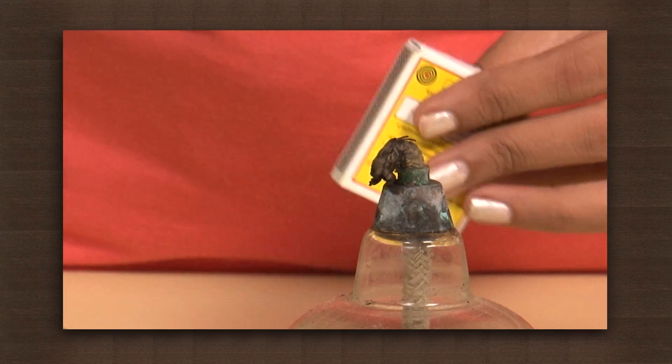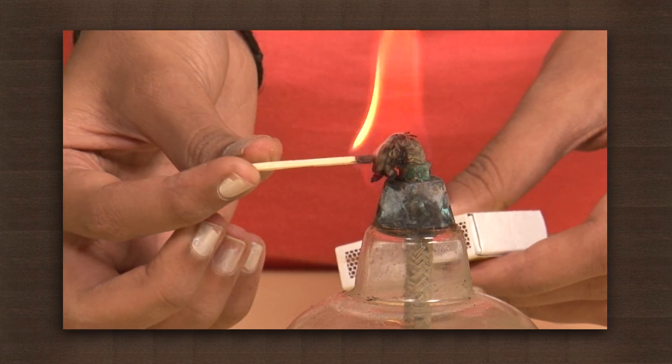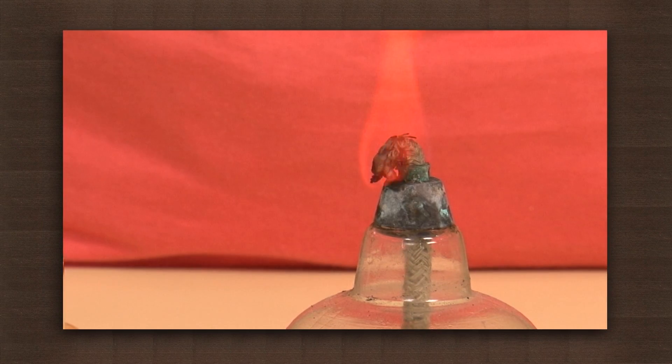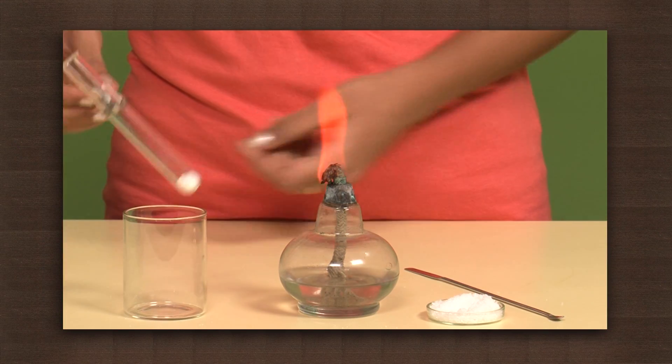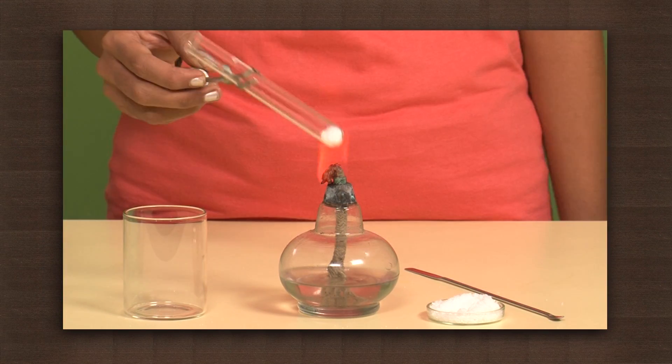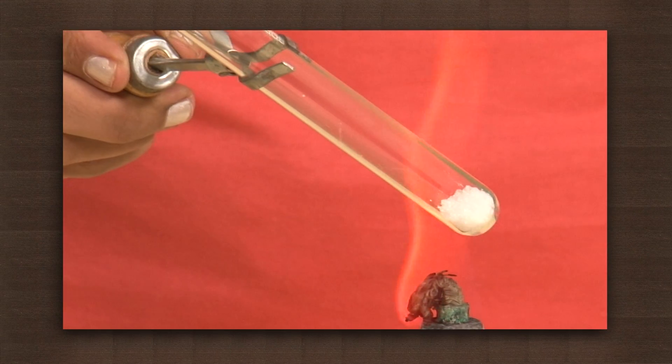Now light the spirit lamp and hold the test tube with the holder. Heat the test tube over the flame.